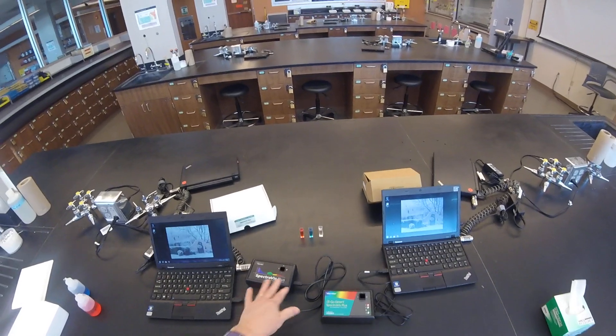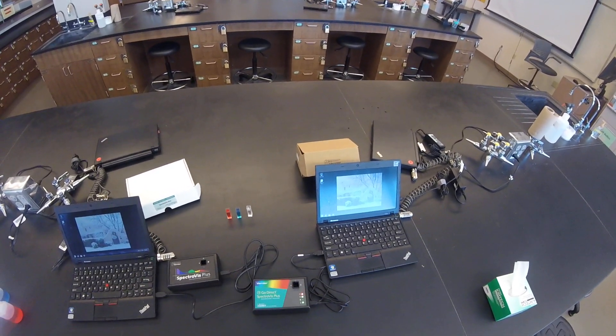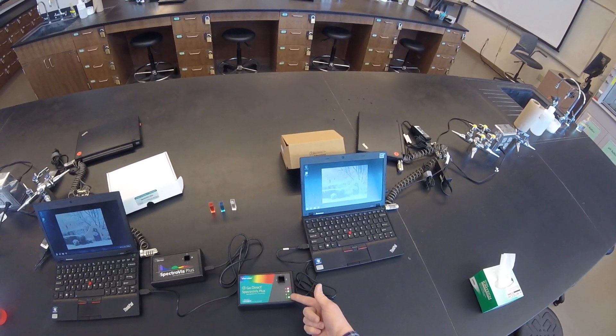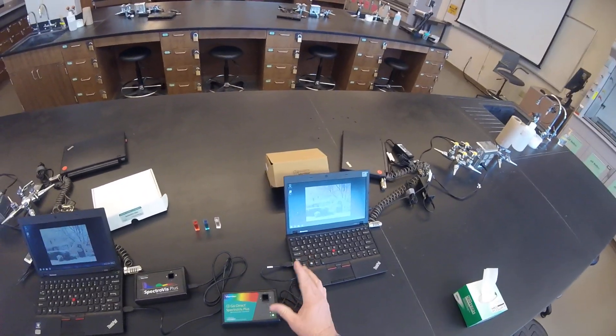What you'll see is nothing will actually show up here, but we're going to see lights on the GoDirect SpectraVis Plus. It indicates that it's being powered through the USB. The power is on. This red light means that there's no battery attached, and that's fine.